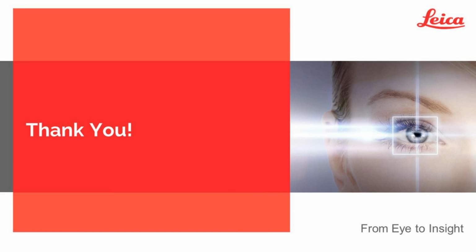Great, thank you. Another question here, can I apply a trained model to multiple images? Yes, with a deep learning model, it's similar to a machine learning model in that you can apply it to multiple images. And because the rules are more robust, relatively speaking, you can also apply it to data sets that look slightly different, and in some cases it might even identify things that it has not seen.